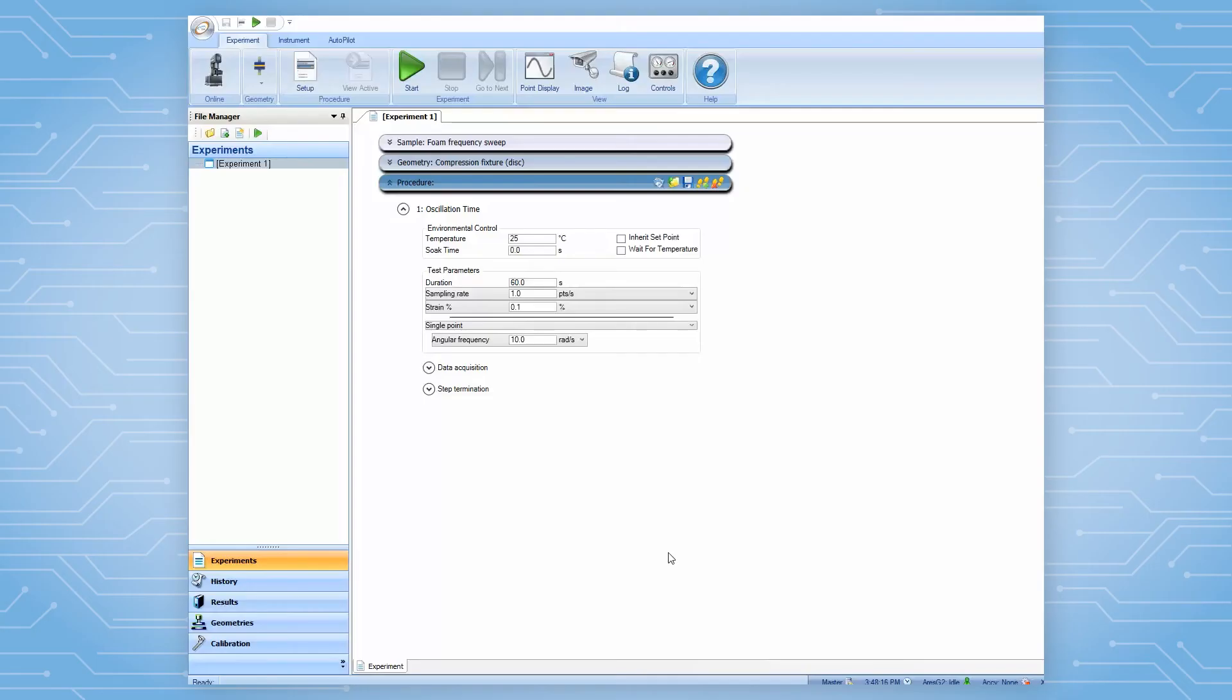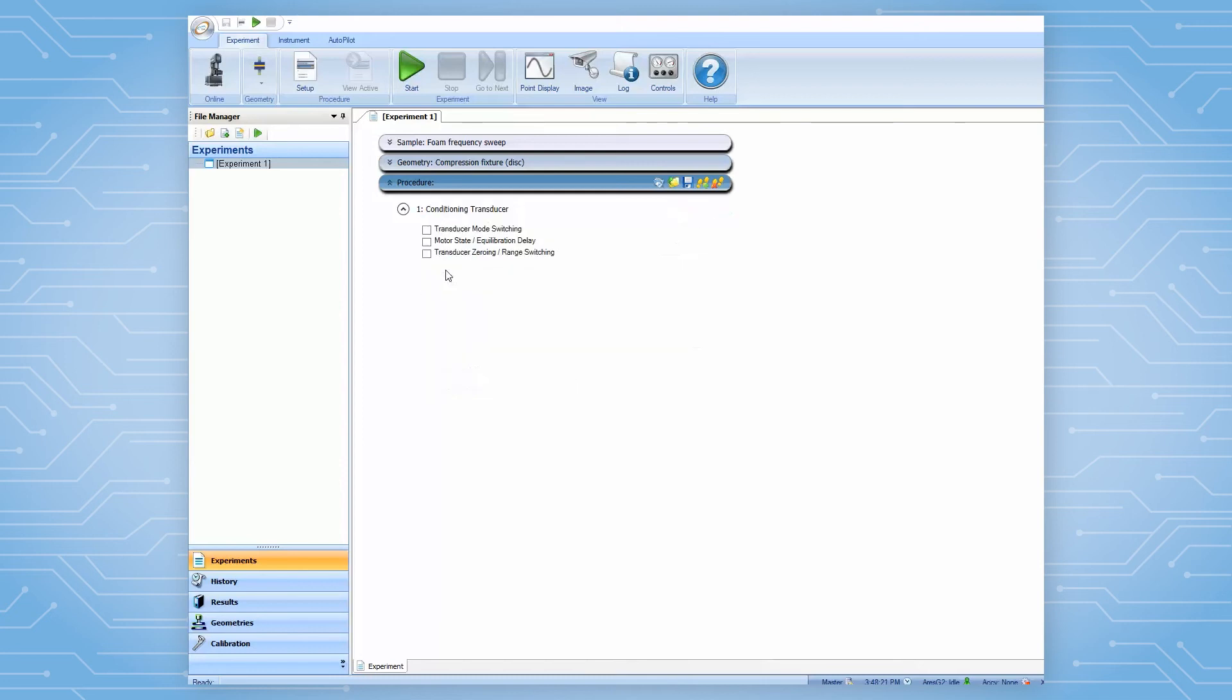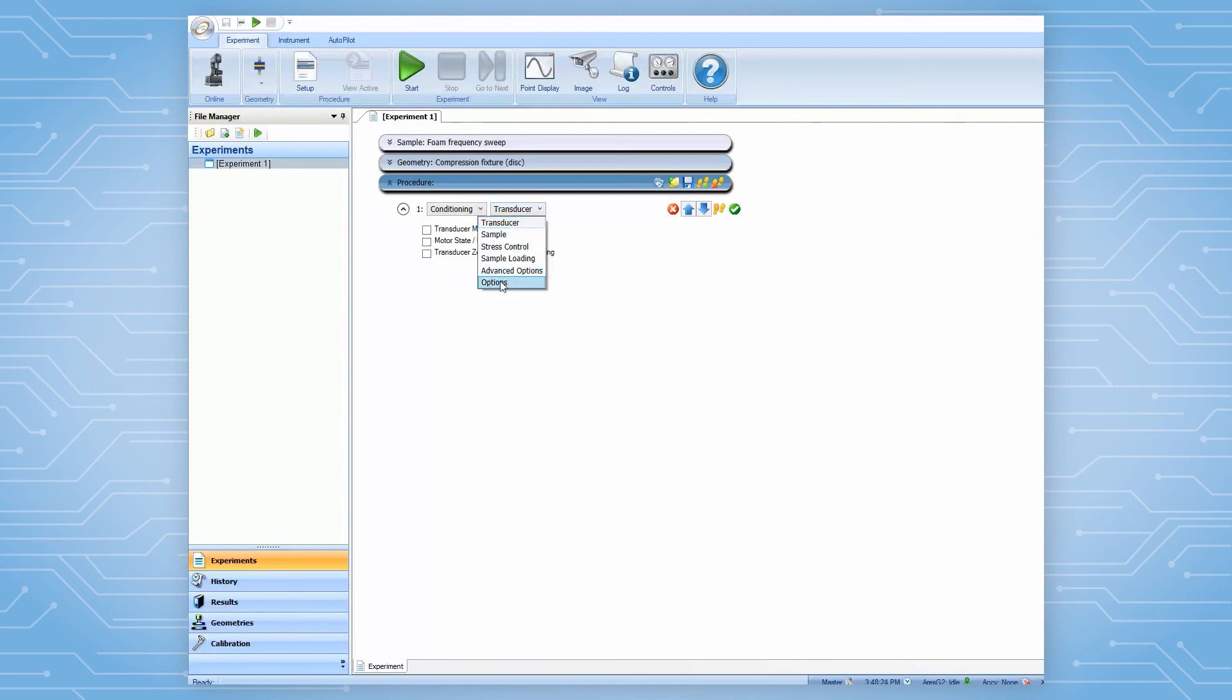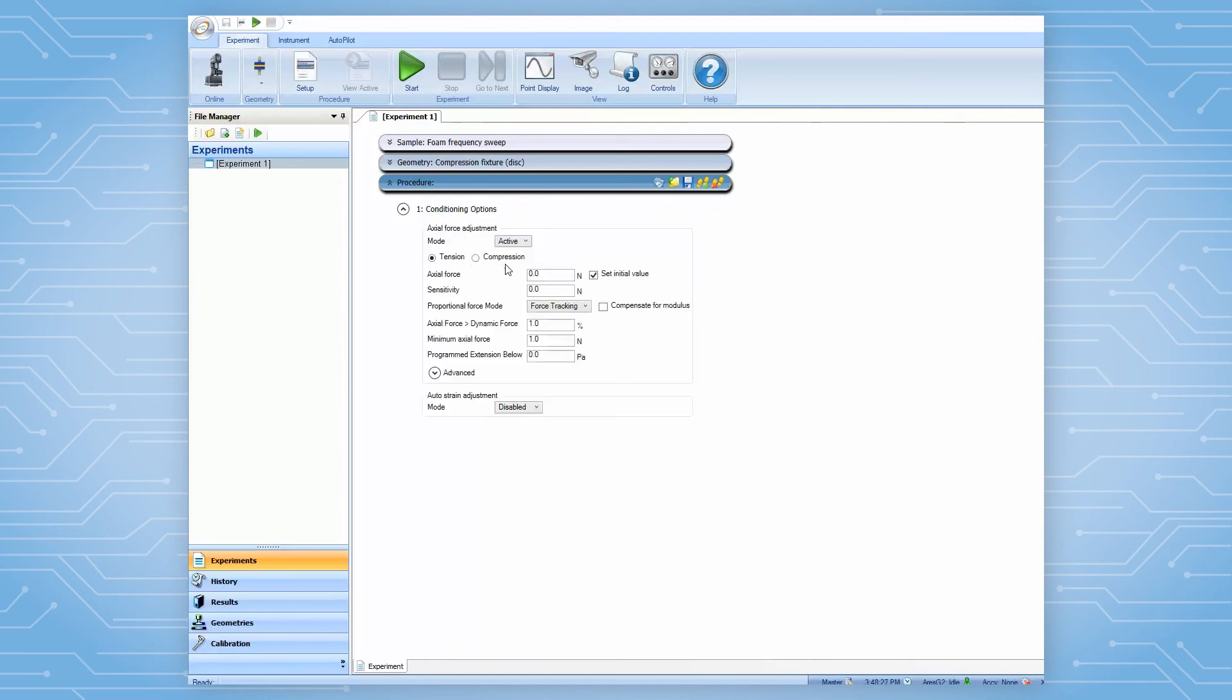For example, setting up a compression frequency sweep test on a foam sample will include two steps. In the first conditioning step, the operator needs to set up the appropriate initial preload force and the force tracking conditions based on the sample stiffness.